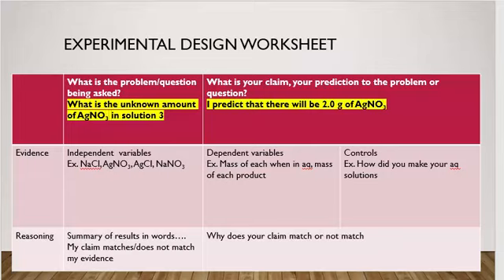I'm going to consider my controls. How did I make those aqueous solutions? Did I keep it constant between the amount of water? Did I keep it constant between the amount of grams?